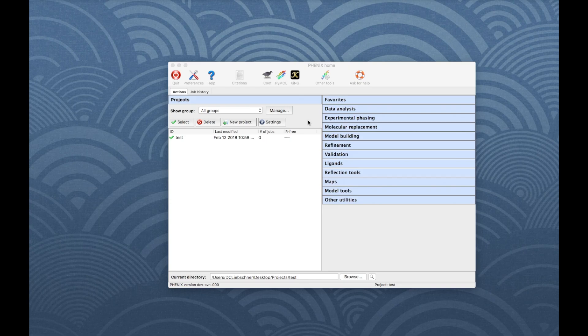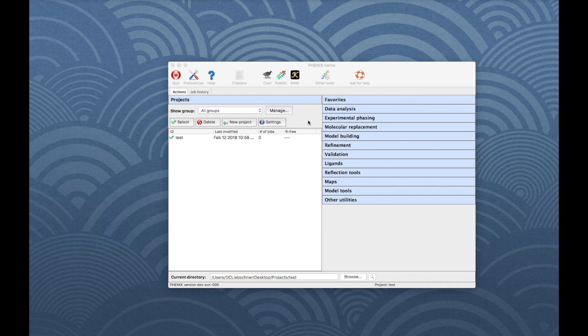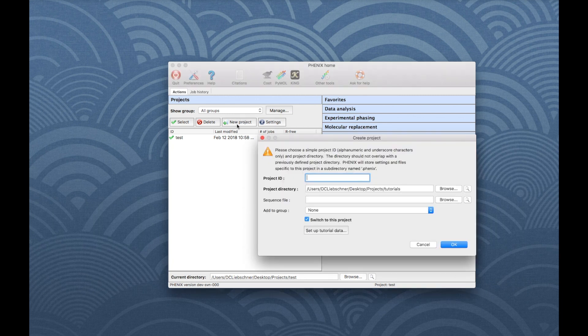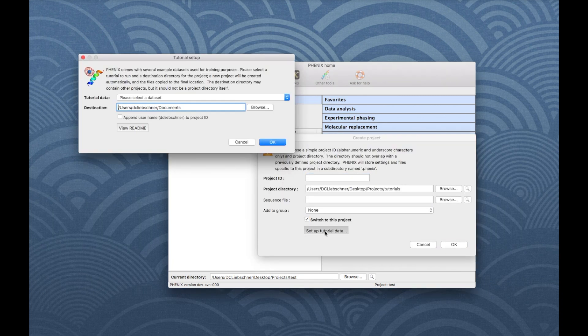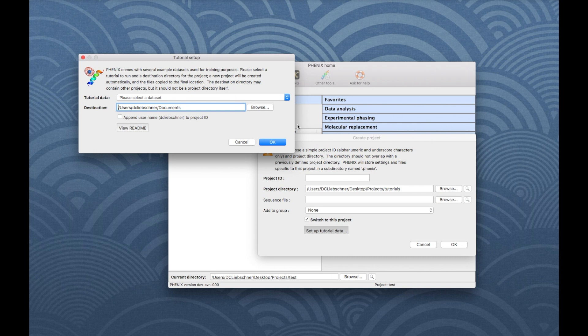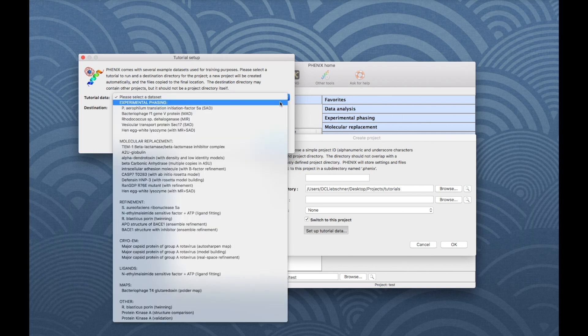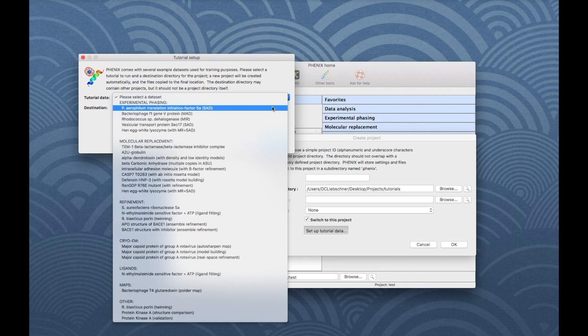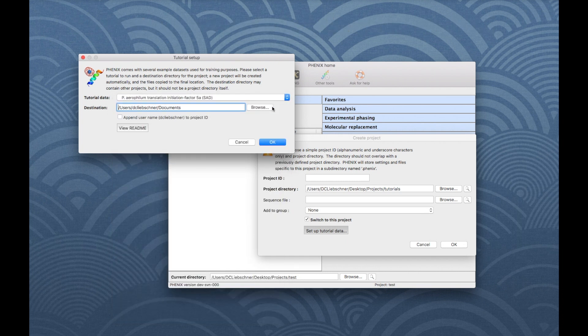To run this tutorial, we will use example data coming with the Phenix installation. Open the Phenix GUI, then click New Project and choose Setup Tutorial Data. Select the first tutorial dataset, Translation Initiation Factor 5A. Choose an appropriate location to save the files and click OK.